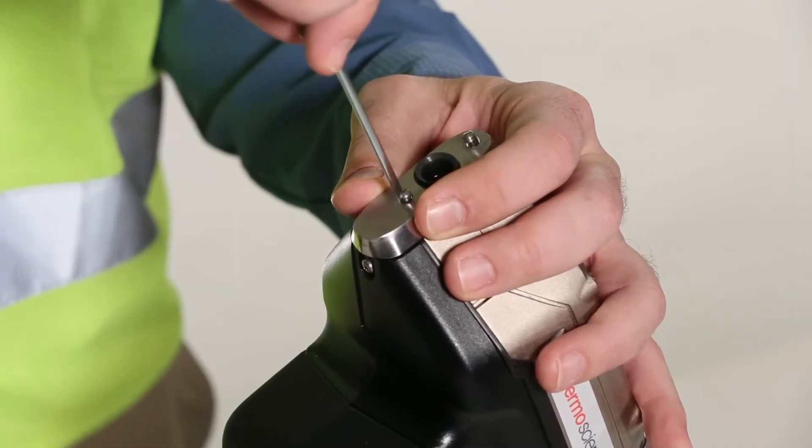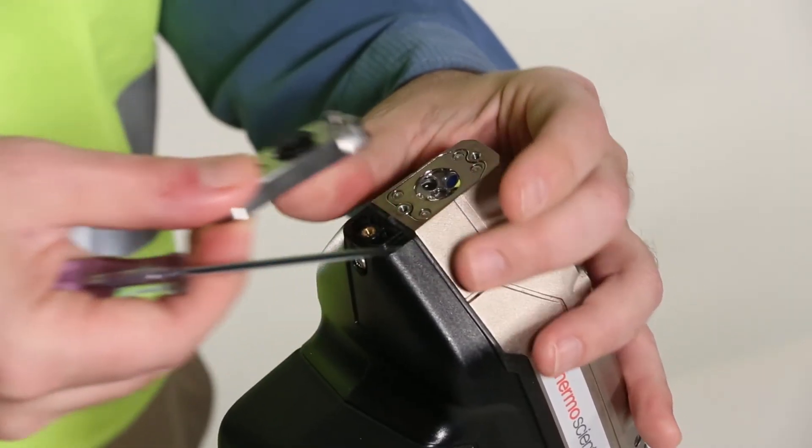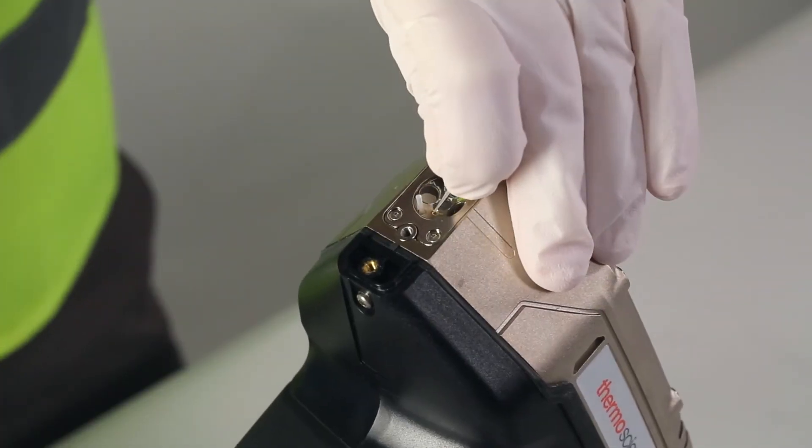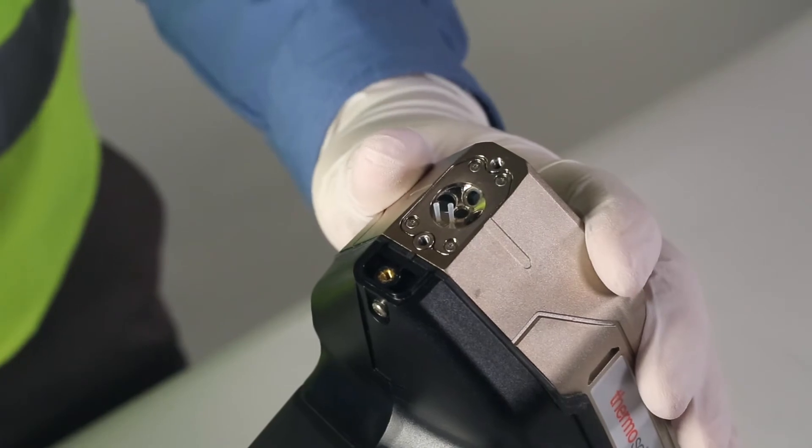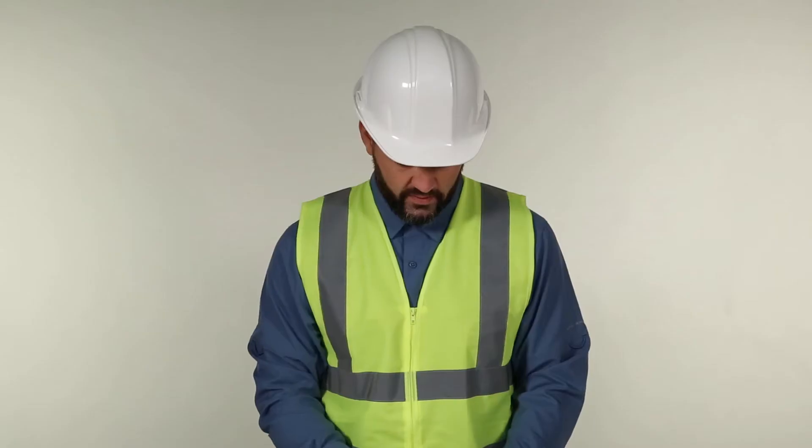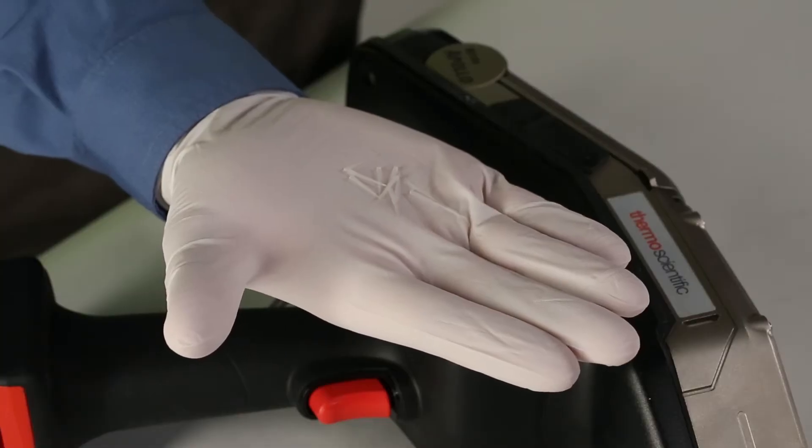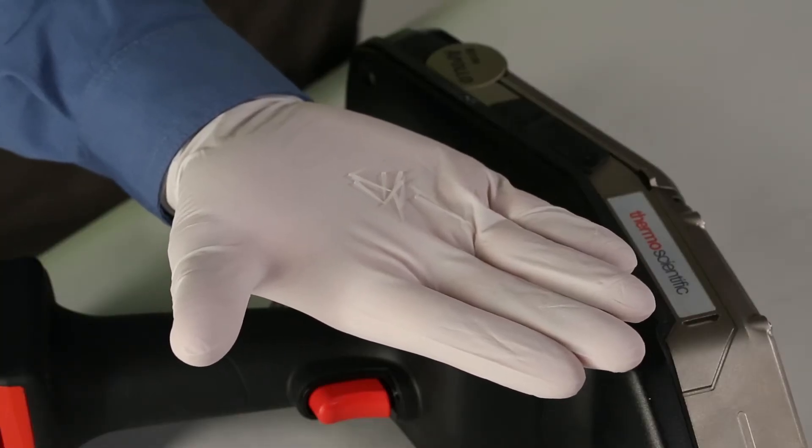Use a flathead screwdriver to remove the metal nose piece on the front of the instrument. Prevent any cleaning mixture from entering the analyzer by using the provided argon port plugs to seal the argon ports. Wear protective gloves when handling the plugs to avoid the introduction of contamination. Be sure to take special care of the plugs as they are small and easily lost.